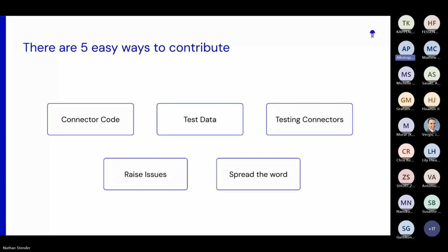Testing connectors: if you have one of the instruments that we support and you want to produce ASM, like I said, even if you're not associated with Benchling, you can write a script and call this. And again, another common theme is that all these instruments output in several different formats, sometimes for no reason at all.